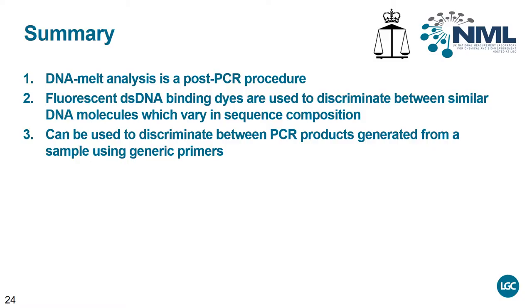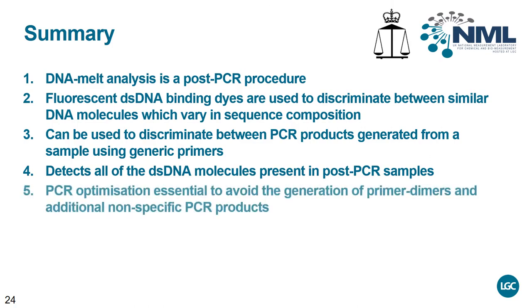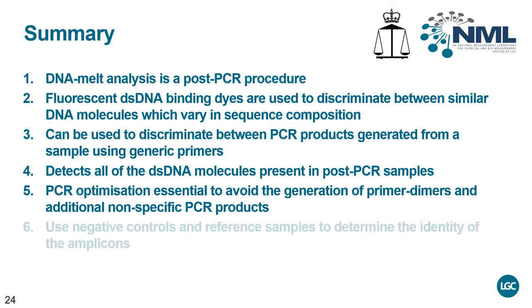However, the melting analysis procedure will detect all double-stranded DNA products generated during PCR amplification of a target, so careful optimization of the PCR reaction and preparation of DNA template is required. It is important to include suitable reference samples, if available, as well as appropriate PCR amplification controls.